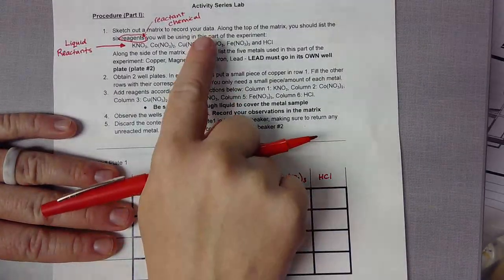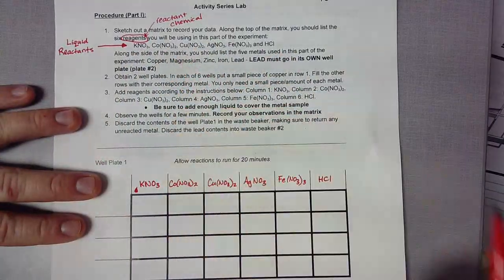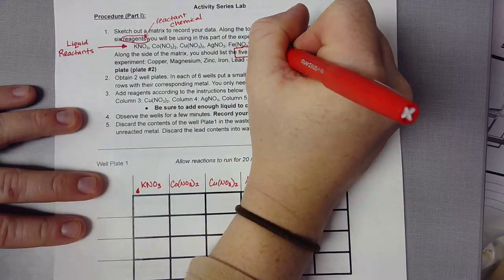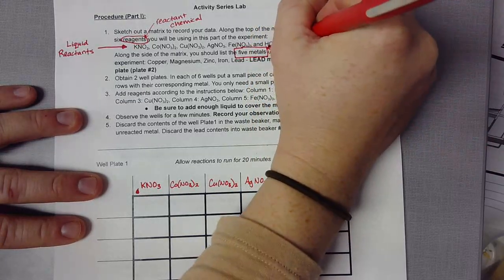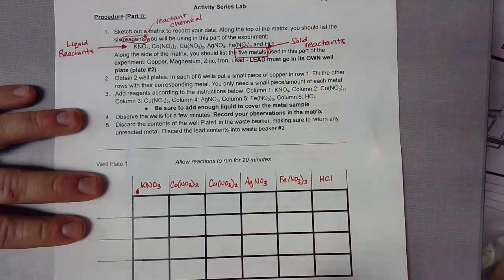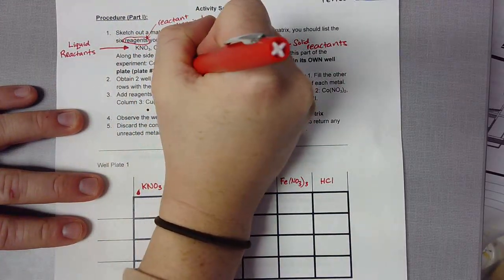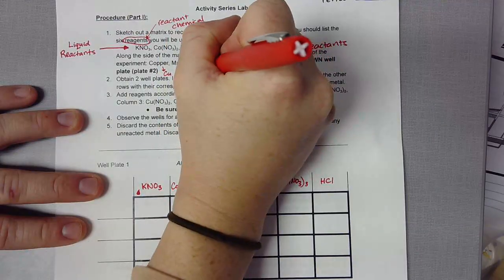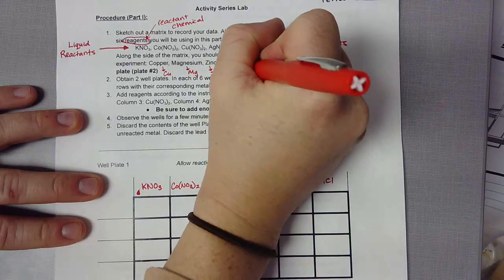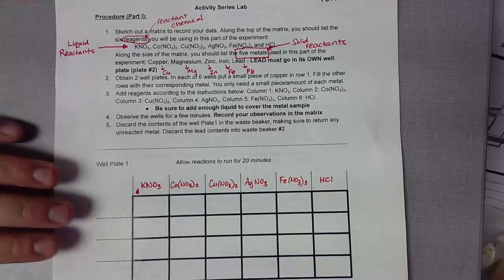So top of the matrix, I've listed my liquid reagents. And then along the side of the matrix, I'm going to list my 5 metals, which are going to be my solid reagents or solid reactants that I will be testing. So the 5 metals that I have are copper, which is Cu, magnesium, Mg, zinc, Zn, iron is Fe, and lead is Pb. So those are going to be the symbols for our solids or our metals.